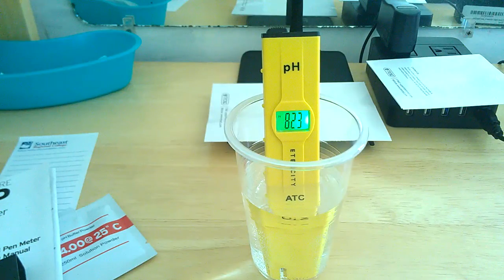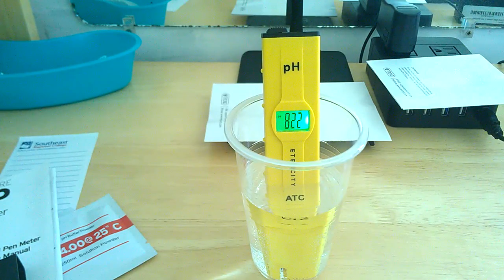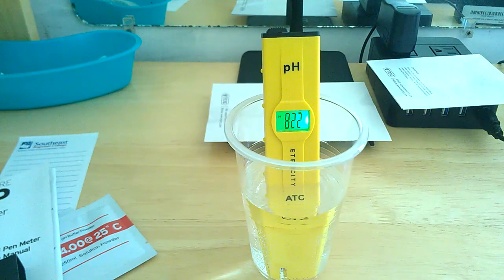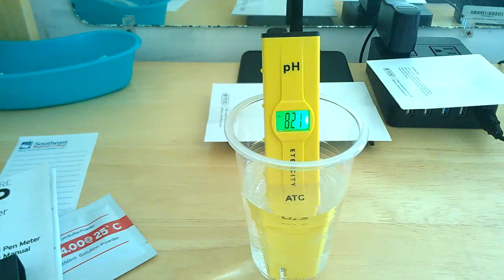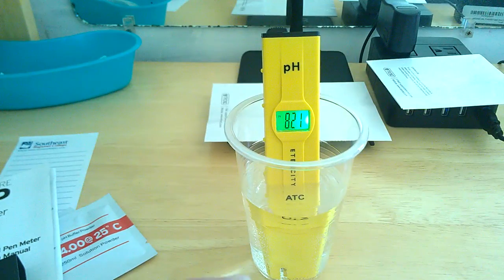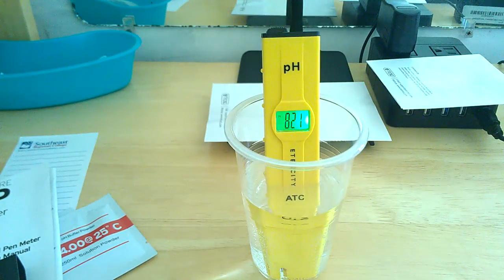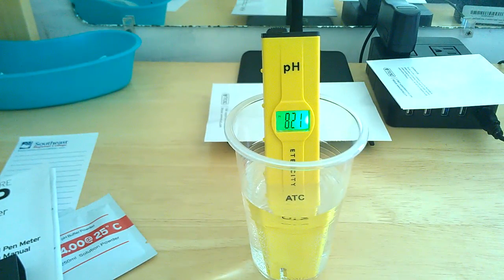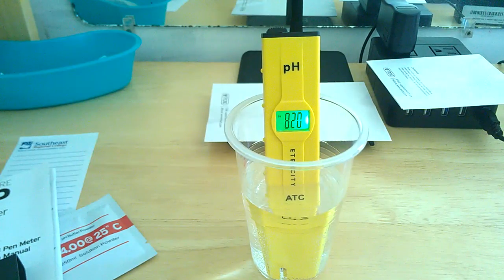I don't know exactly how far it's going to come down here. This is the first run. It looks like it's slowing down a little bit. You can roughly see that you have roughly an 8.2, 8.1 alkalinity reading on the tap water here where I live.